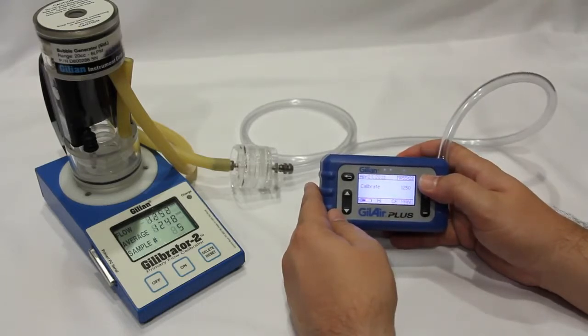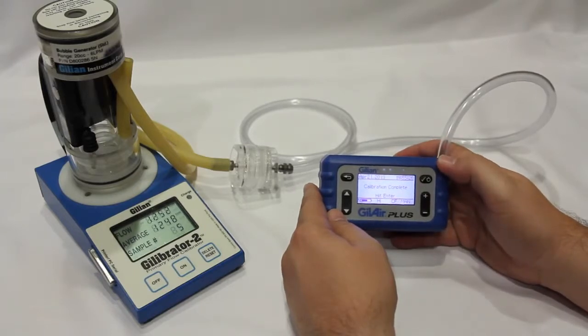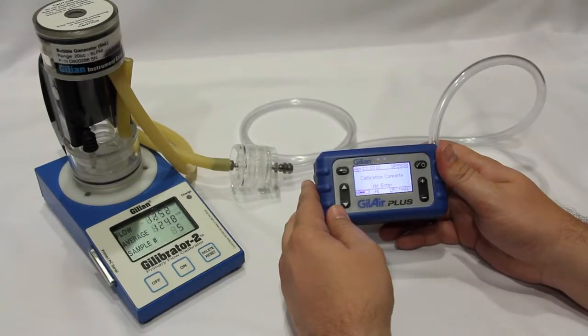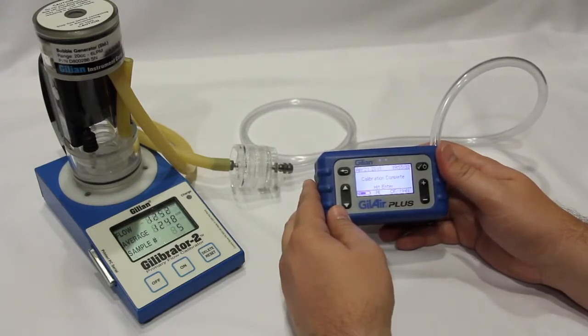Once the flow rates match, press enter to accept the calibration, or escape to go back. In this case, we'll press enter and accept the calibration.